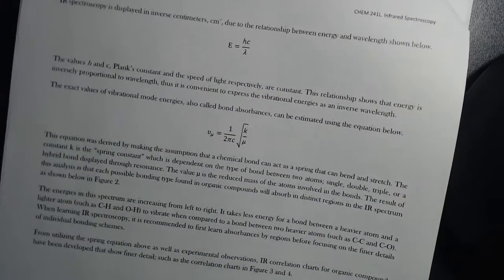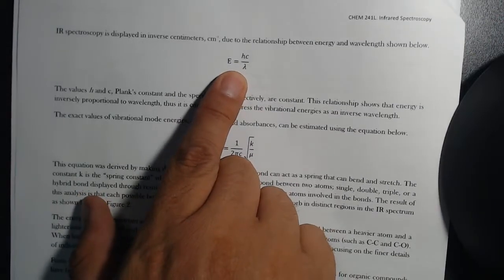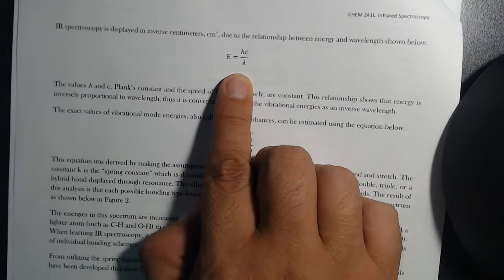All right, so these equations here are essentially summarizing why we talk about it in terms of the units here. The units are 1 over centimeter, or inverse centimeters, as people like to say. I will tend to use the term wave number, which is another terminology here. It is a function of 1 over wavelength.